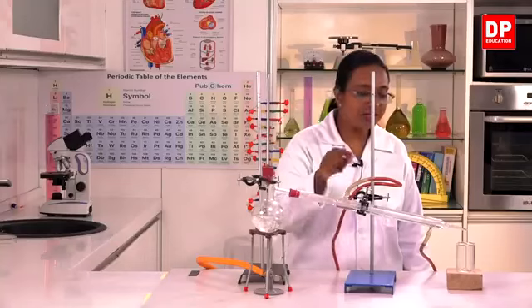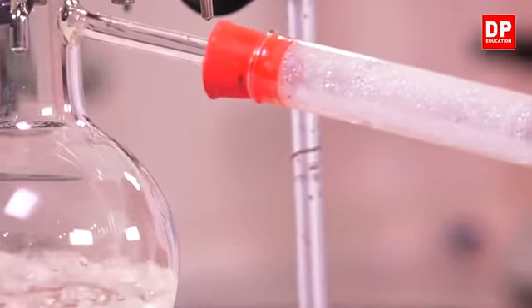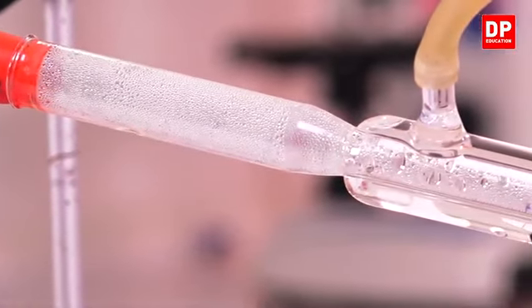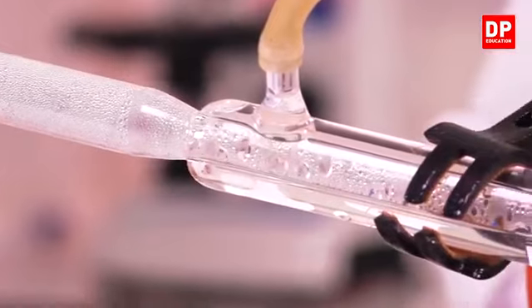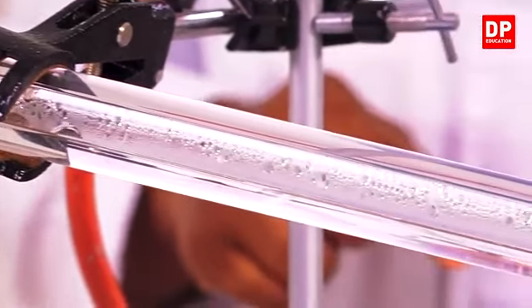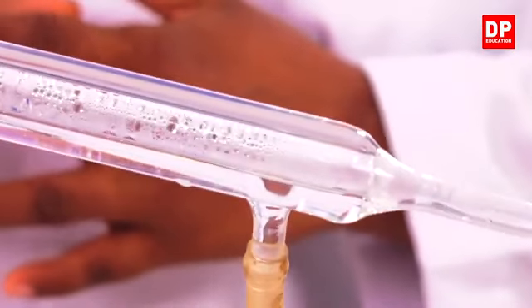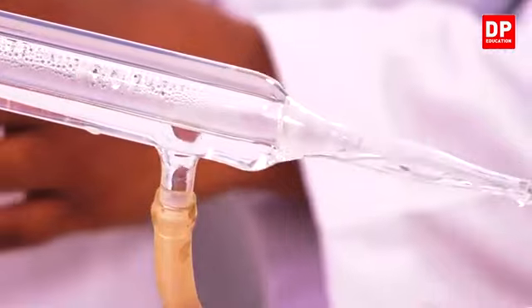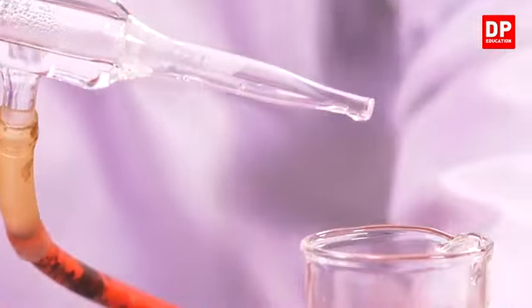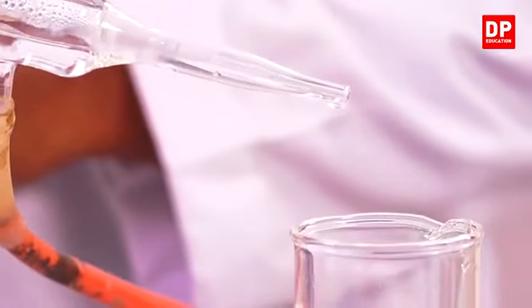If you observe the condenser now, you can see water coming through it because the steam is condensing within the condenser and the liquid is coming out from the outlet. So this is how we obtain the distilled water. We had the well water here, we produce the steam, and from the steam we condense it and obtain the liquid water.